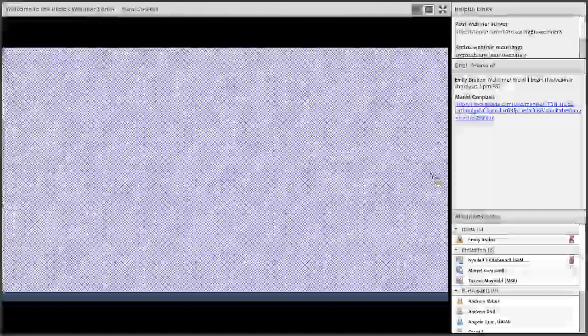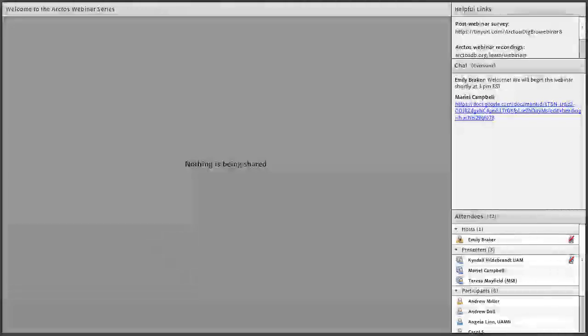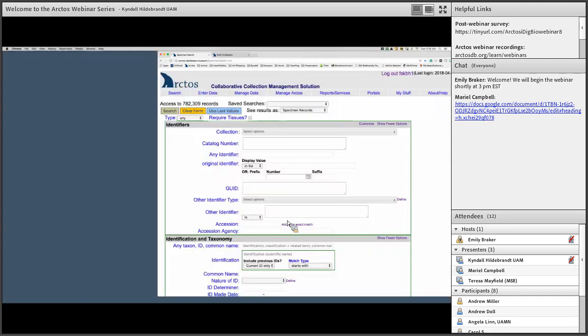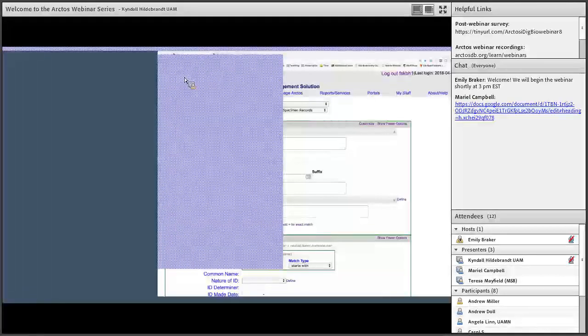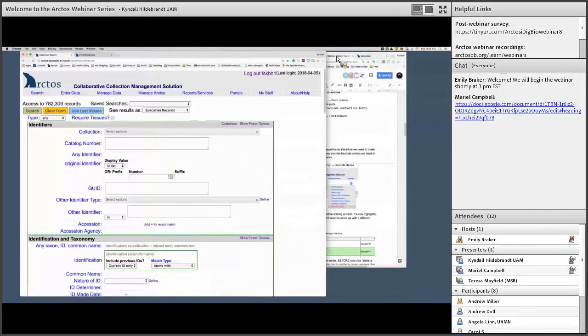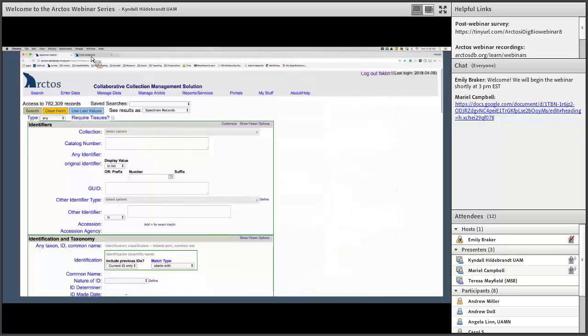That's about all I have for examples. I'd like to take any questions related to what I've shown. If there are no questions, I'm going to pass it over to Kendall, and she can provide some more specific detail. So I'm going to go over a little bit more of basically how we actually do this and get set up using the barcode series.